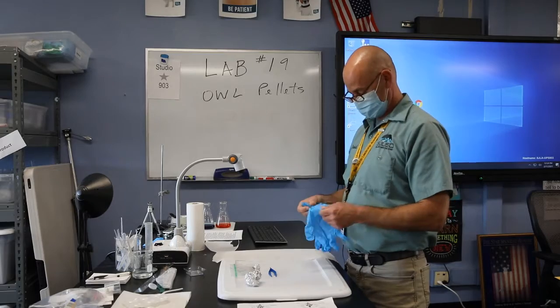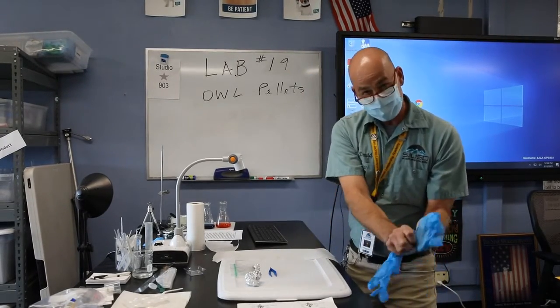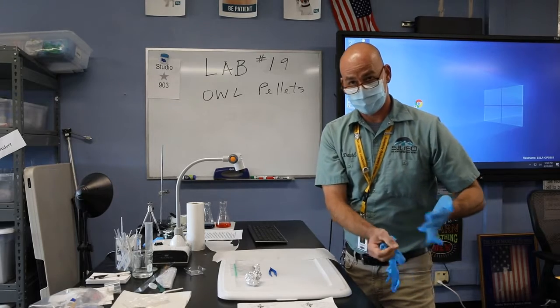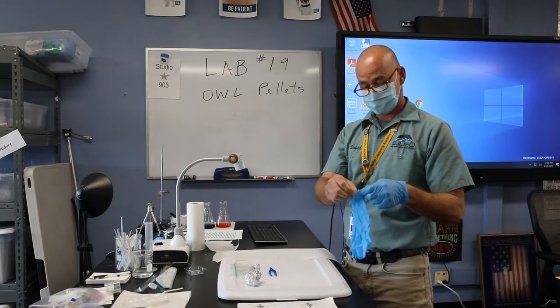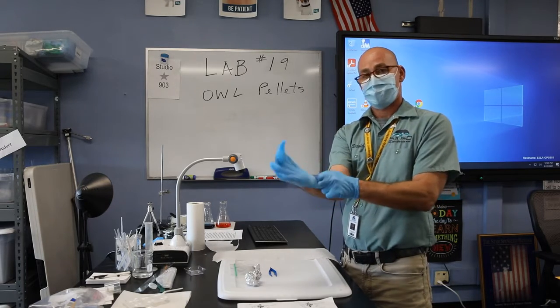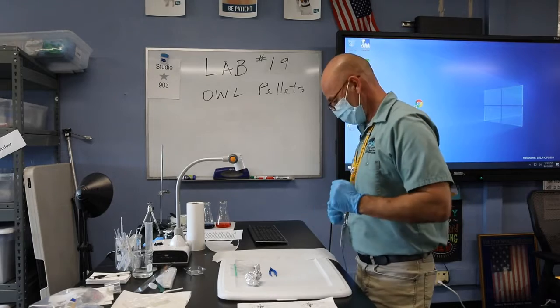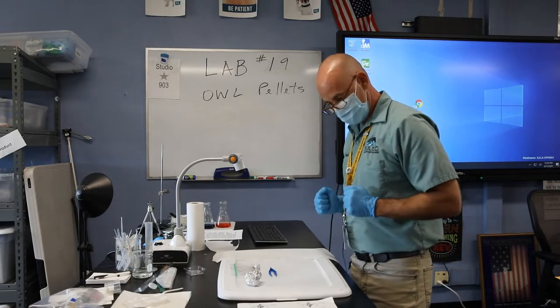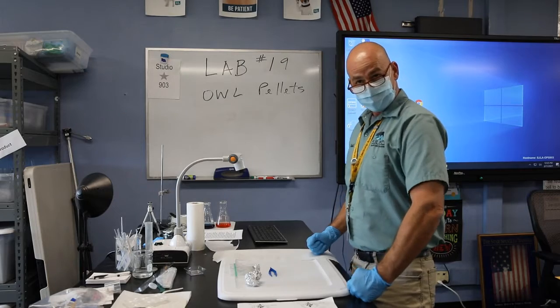Start it up. So, Dave has an owl pellet. Remember that the owl pellet is not the poop of the owl. It is a vomit. Owls don't chew their food. They simply swallow it whole. One stomach digests the soft tissue. And then every night, an owl will sit quietly, and he'll throw up a pellet of bones and hair. And from that, you can tell what the owl ate that day.